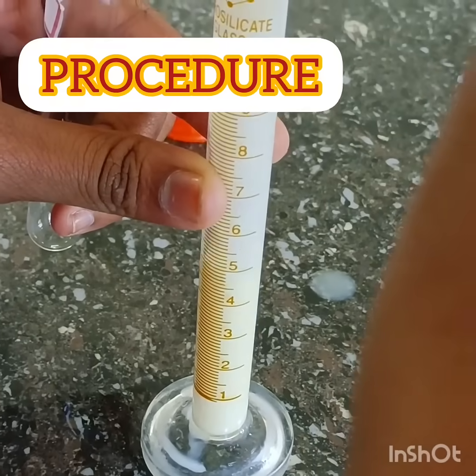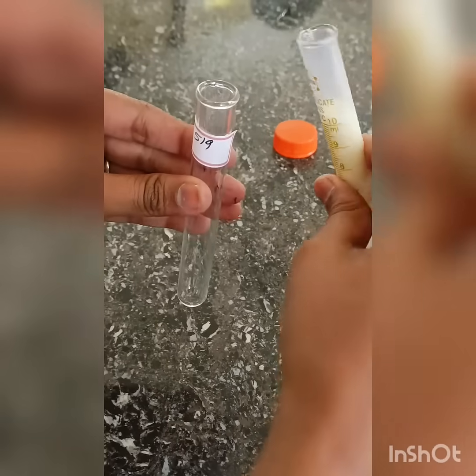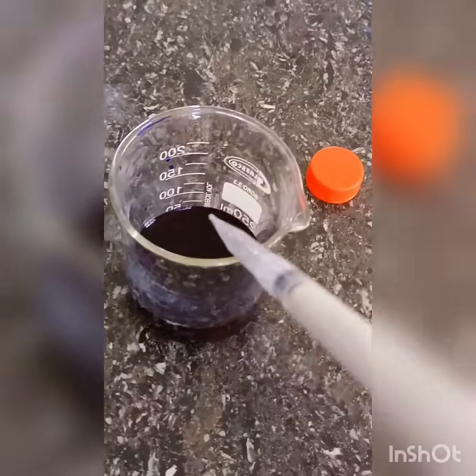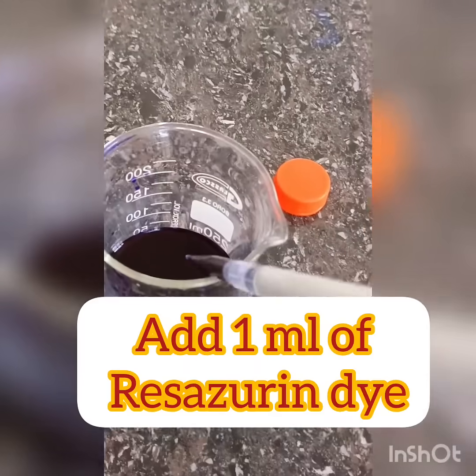Procedure: Pour 10 ml of different milk samples into different sterile test tubes. Then add 1 ml of Resazurin dye solution into all the test tubes.